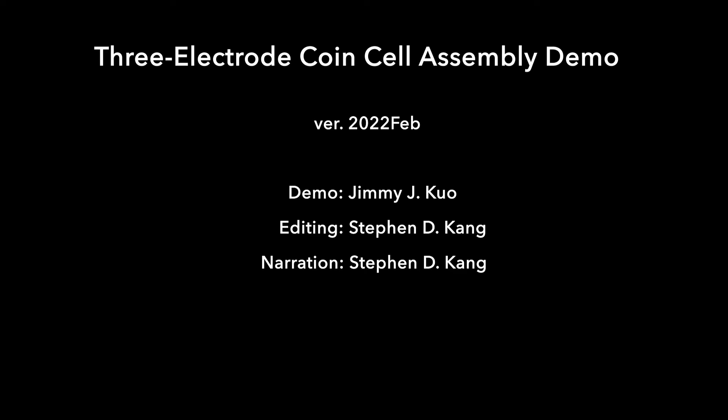Hi everyone, I'm Steven Gong. In this video tutorial, we're going to show you how we make three-electrode coin cells as of February 2022. This version works pretty well for both normal cycling and EIS measurements.